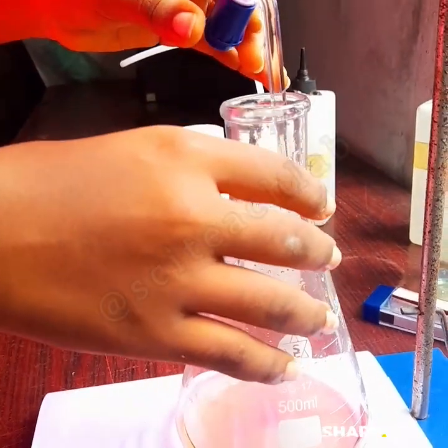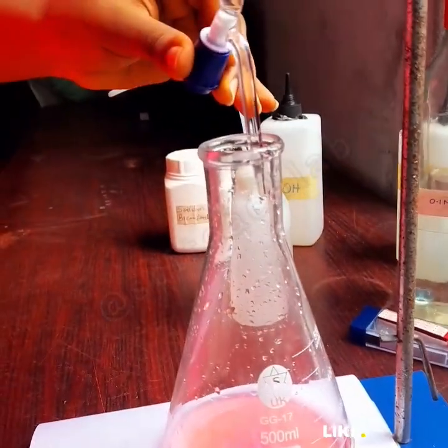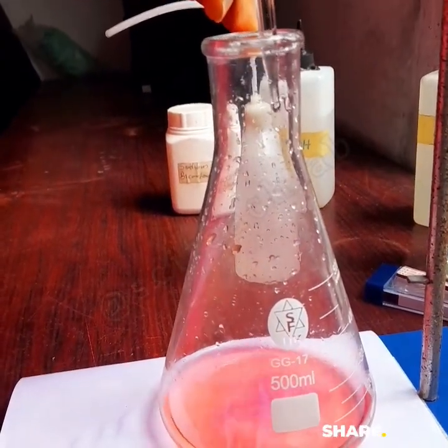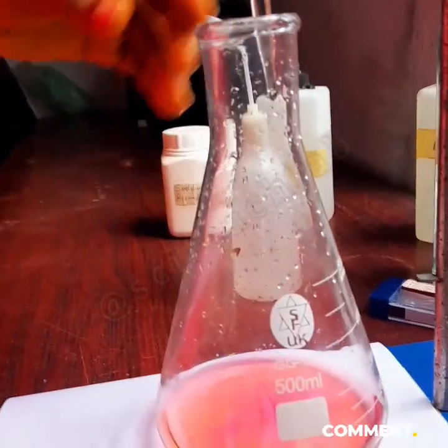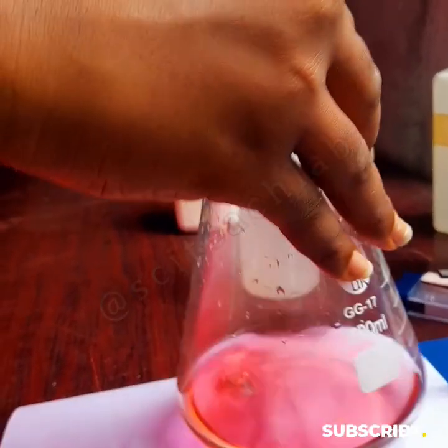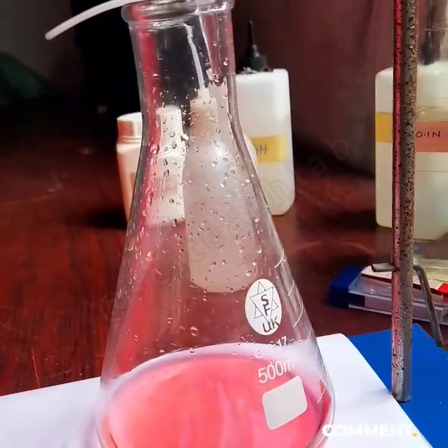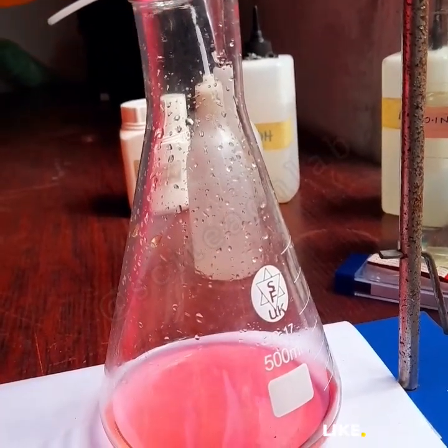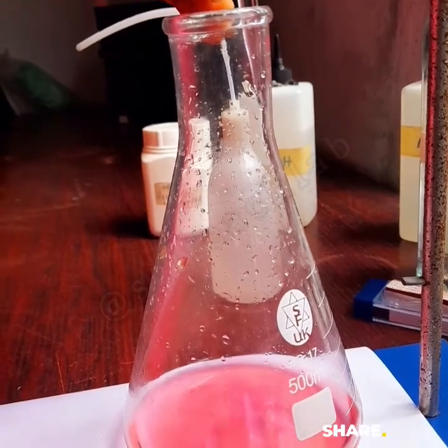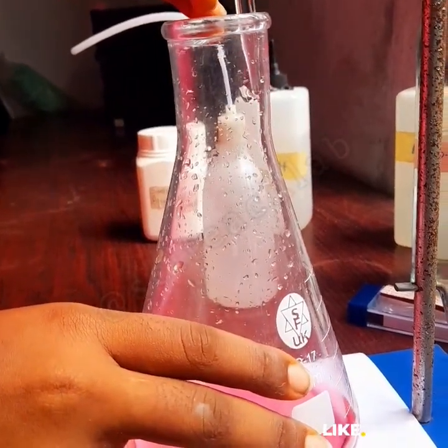So it's either you lock it, or if the stopper is not working properly, then it's better you remove the conical flask once the endpoint is reached. Just remove it. So if you keep adding and the color turns pink, okay, let's add more so you see how the color can become too pink.